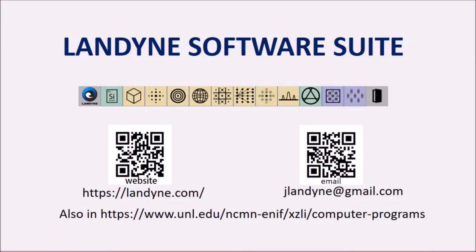In this tutorial video, I will introduce SAKI, a computer program for simulation and analysis of Kikuchi pattern. This is one of the components in Landyne software suite for electron diffraction simulation and crystallography analysis. You may download the software suite from the websites on the screen.